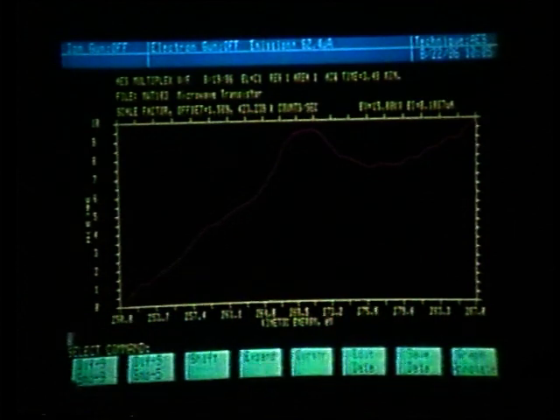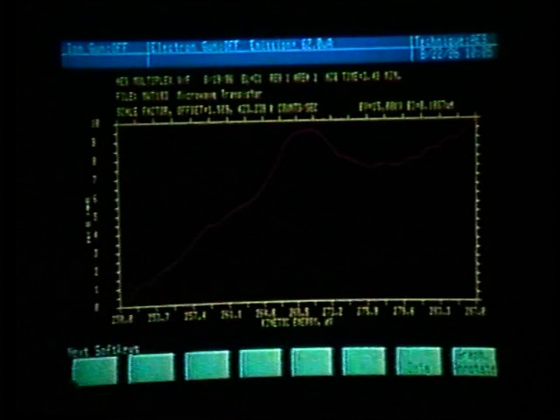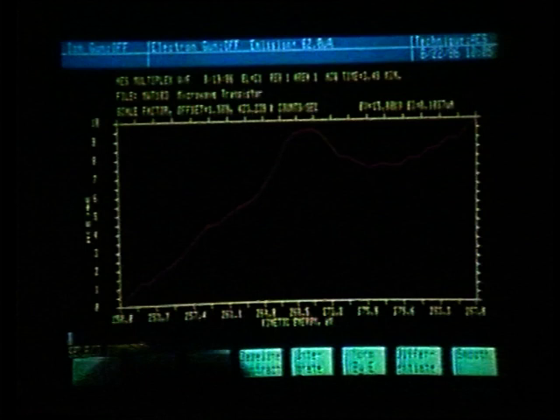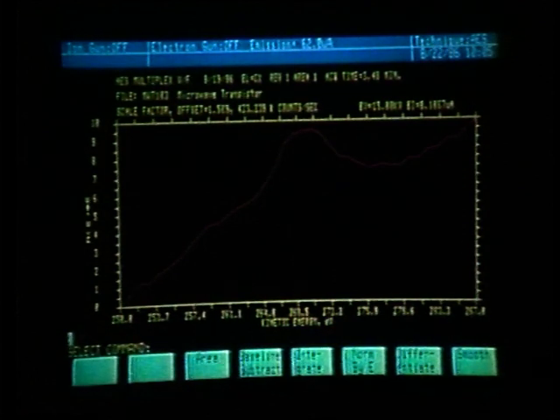Let's go to our next data bank, again pressing function key number 23, and once more function key 23. I am looking for the data bank with the miscellaneous data massage routines that was on data bank 3, which we now have displayed.